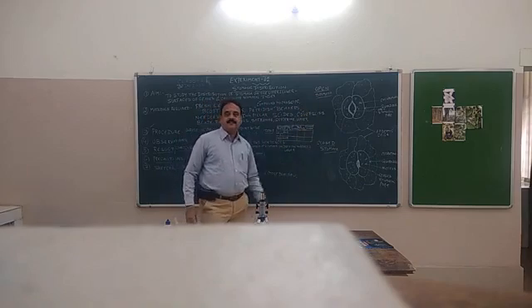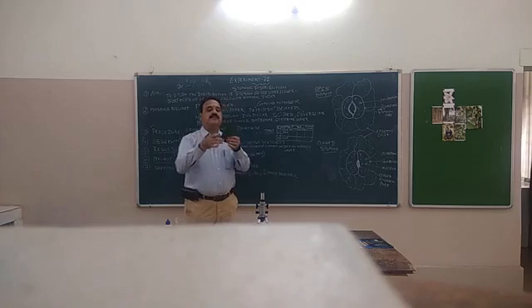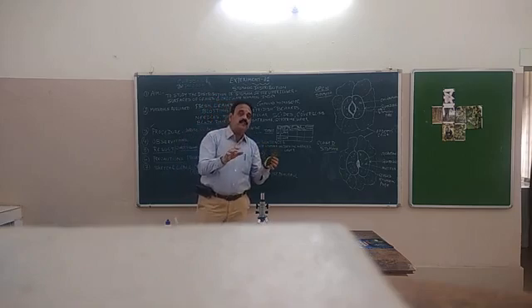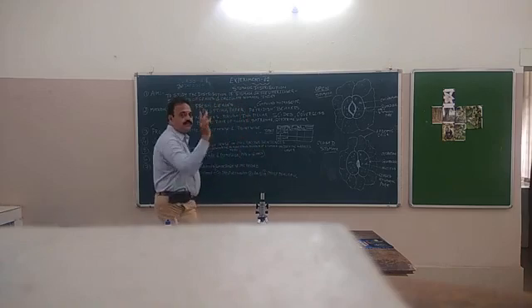Normally we can't see this, though they are present on both the upper surface as well as the lower surface of the leaf. As all of you know, this is the upper surface of the leaf, this is the lower surface of the leaf. So stomata will be present on both sides depending upon the type of plant, like you have monocots as well as dicots. So I will not say in which one it is. You need to find which one is on the upper surface and which one is on the lower surface, and tell me in the calculation or result.